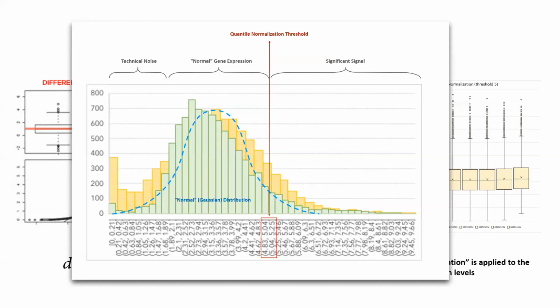Sorry, maybe I could just add to this. So the threshold is actually for normalization to happen under the threshold. Typically the outliers that we care about are outliers to the top of the scale, not to the bottom, because at the bottom you have very noisy data as represented here. Noisy means that there's not a significant difference between conditions, and even if there is, it's below the point of detection. But on the top, for example, if you have very highly expressed genes, that seems likely significant. So the threshold that you select here, everything below the threshold gets normalized. Everything above the threshold is going to stay the same. Yep, perfect. Thank you for adding in. It's a good explanation.